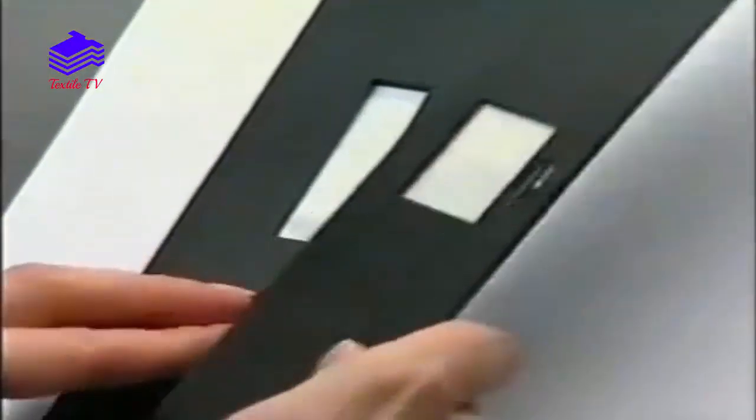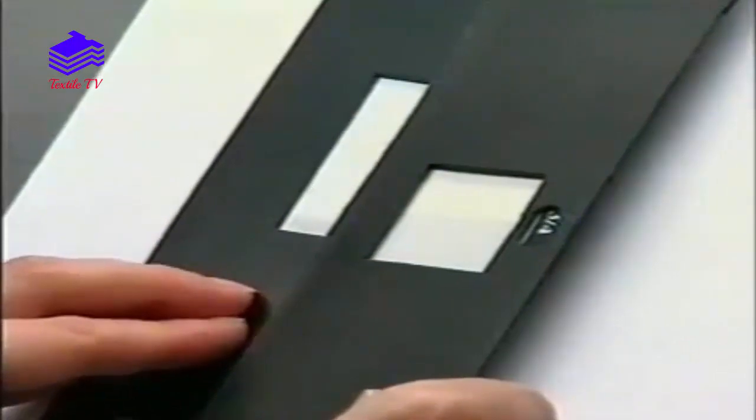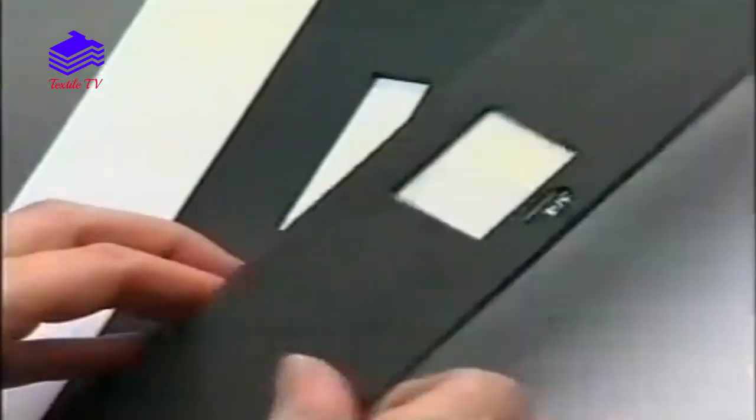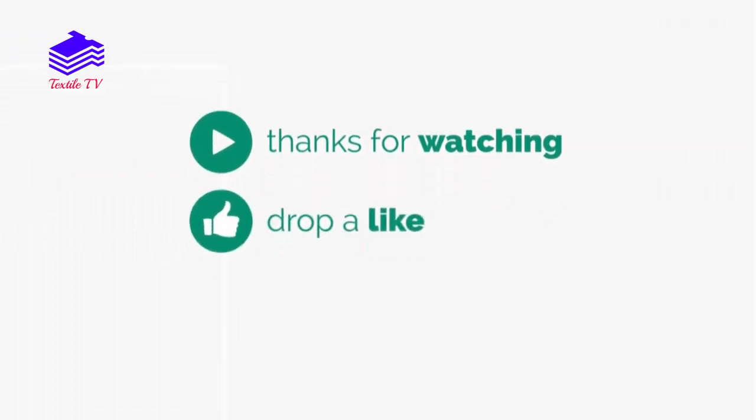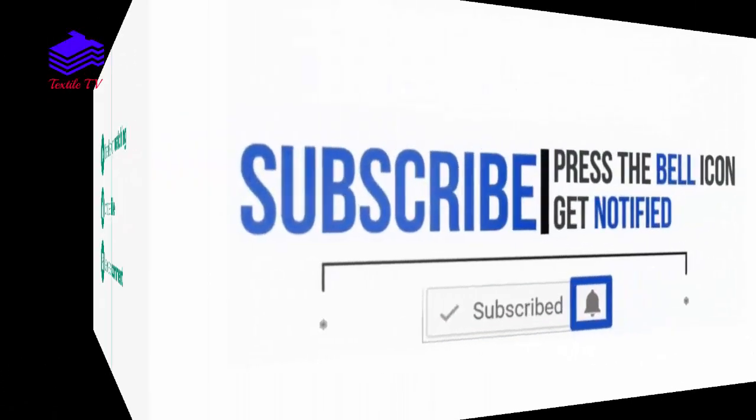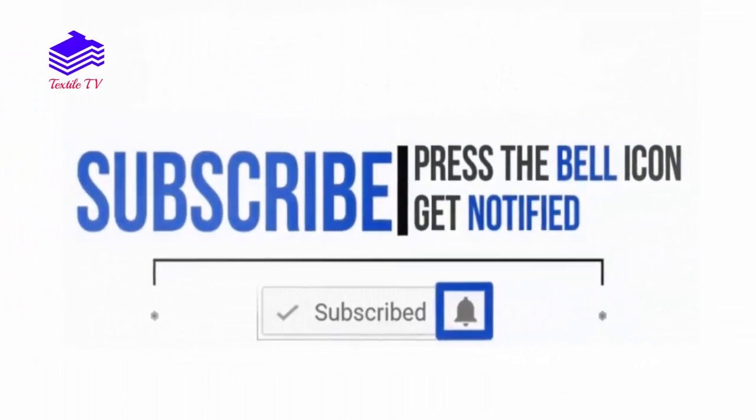When dry, the degree of staining and change in shade is assessed.